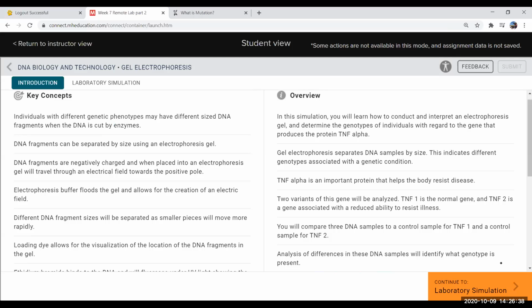So that's, again, called RFLP analysis. Cutting them with the enzymes after we amplify them is called restriction fragment length polymorphism. Let me write that on here. So that was all called restriction fragment length polymorphism. Poly means many, morph means a shape. So we have many different shapes of our DNA once we cut it with these restriction enzymes.